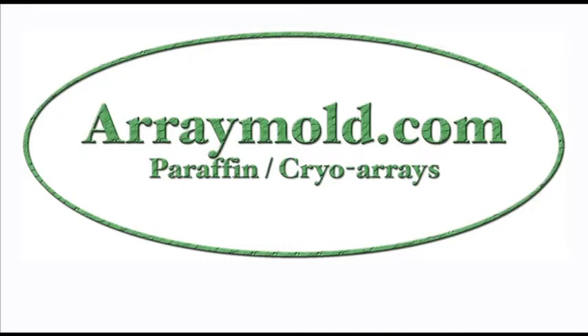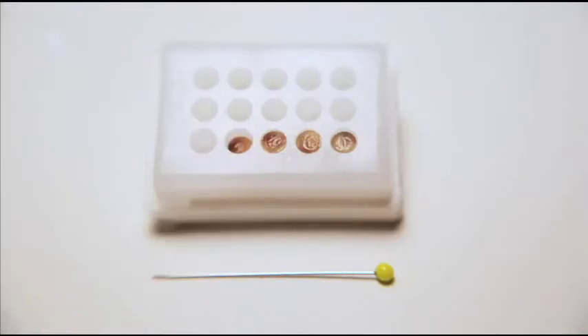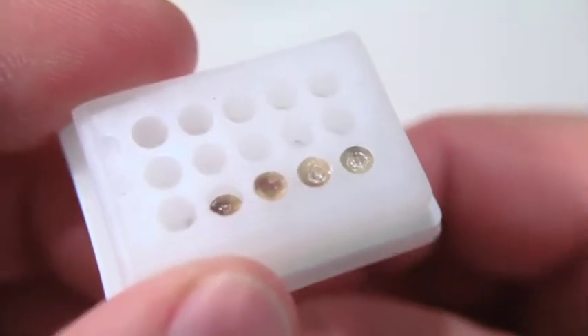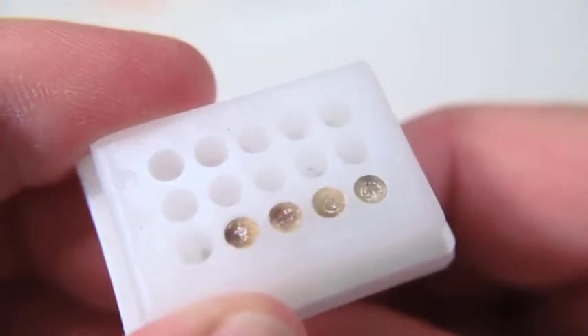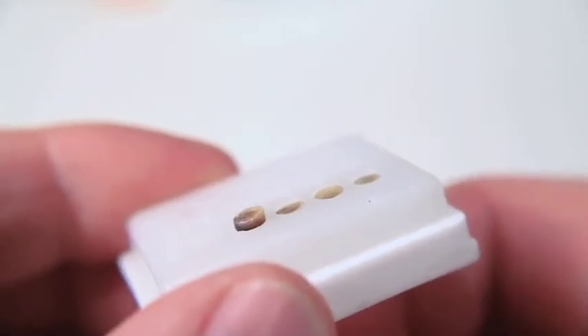The next technique we are covering is called the push up technique. This is very helpful when a core has fallen inside of your Array Mold Block. Using a sewing straight pin, place the pin on the back side of the Array Mold Paraffin Block. Align the straight pin so that it is behind the dropped core. Slowly push the straight pin through the back of the cassette and gently push the core up to the top of your Array Mold.